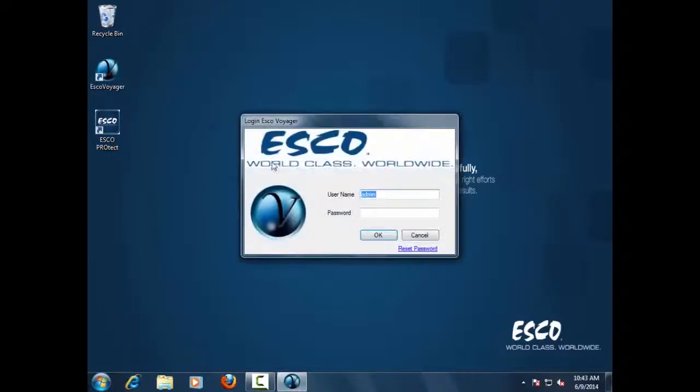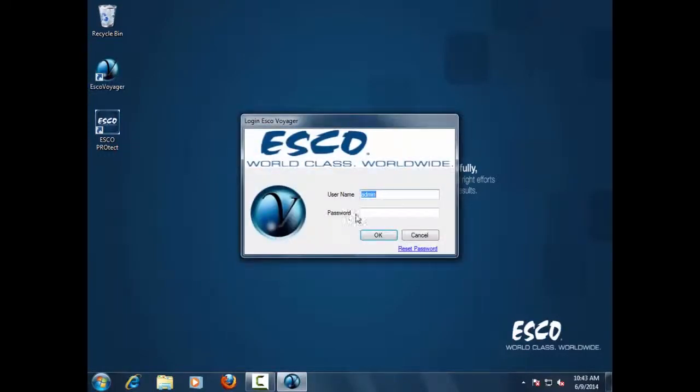To start the ESCO Voyager software system, enter username and password.